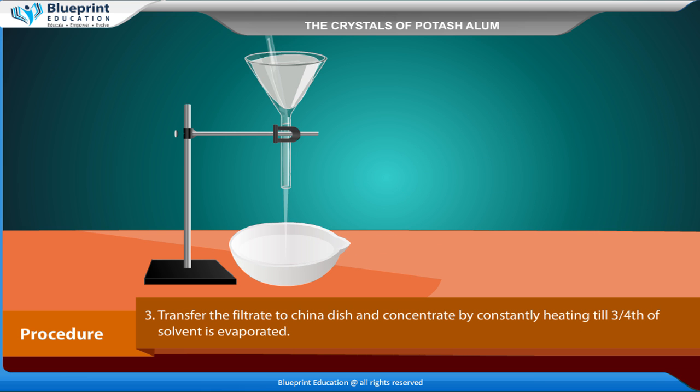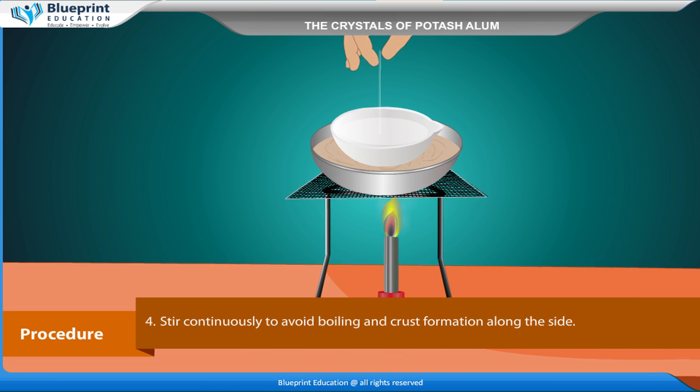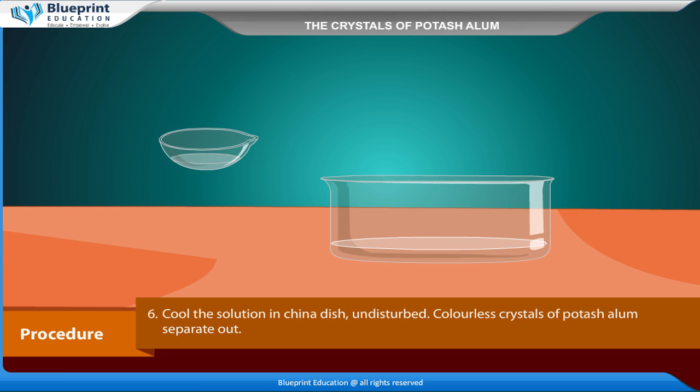Transfer the filtrate to a china dish and concentrate by constantly heating until three-fourths of the solvent is evaporated. Stir continuously to avoid boiling and crust formation along the sides. Check the crystallization point, then cool the solution in the china dish undisturbed.